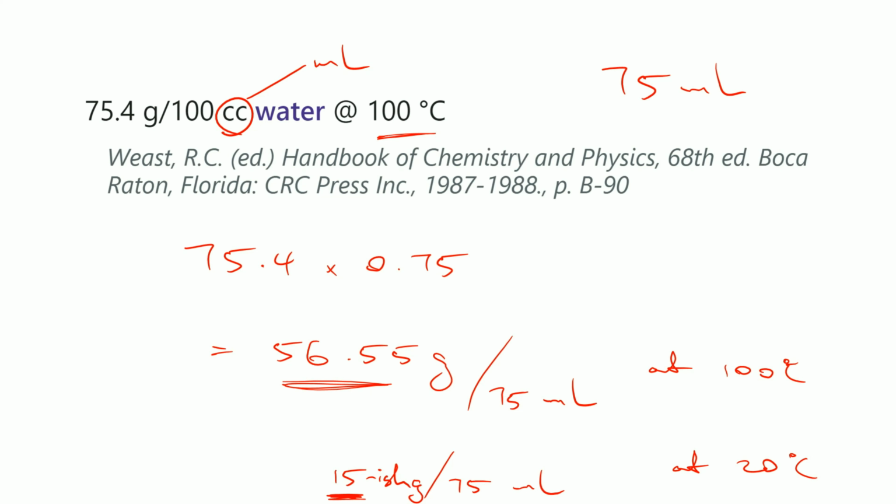Like if I'd checked the solubility at 20 degrees and at 100 degrees, at 75 and at 73, well, that's very little of the salt that is actually going to drop out. So I'm not going to get much crystal formation. However, I can see now that about 41 grams will drop out of solution, so I can get some decent crystal formation. So let's stop talking and stop doing math, and let's go and do the prac now.